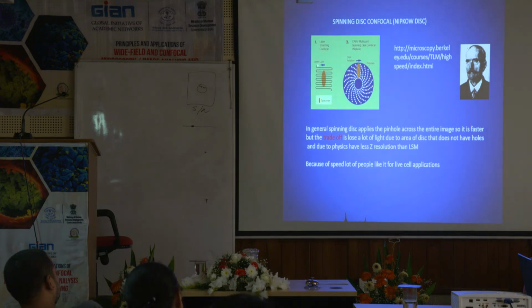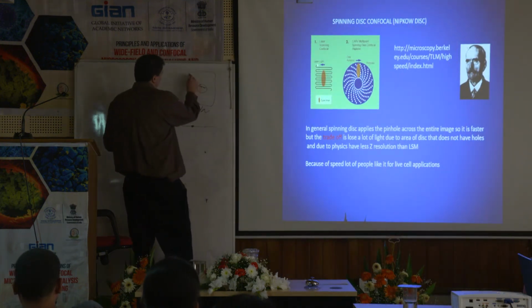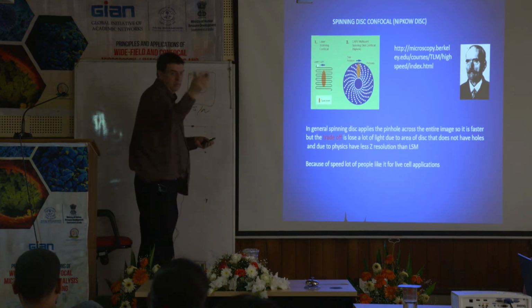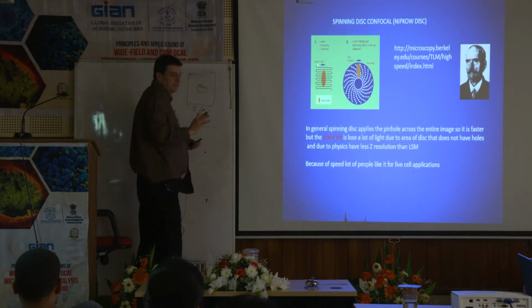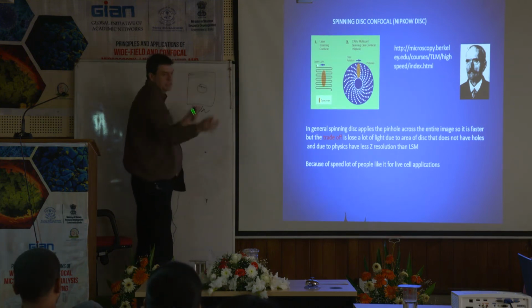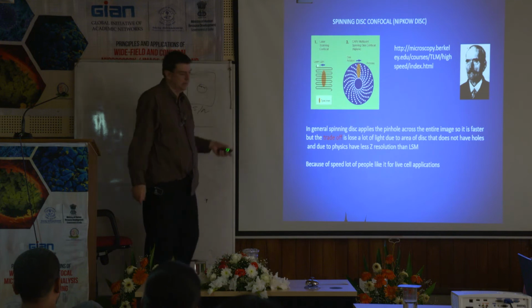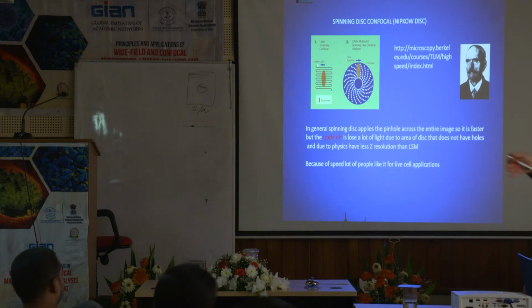Okay? Because remember, with the laser scanning, I'm basically moving the pinhole, moving the pinhole, moving the pinhole, one by one by one by one. Whereas this, everything's the pinhole. So it can just take the whole picture at once. It can just go bam, bam, bam, bam, bam. So it's faster because it's applying the pinhole all over and it's letting you take the whole image at once. Anytime you hear live cell confocal, you start thinking about this thing. Because it's faster. And like you said, it's live cell, it's fast. This is the solution. Usually.